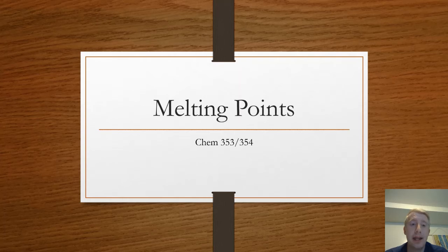All right, everybody. Today I'm going to be teaching you guys a little bit about melting point determination in an organic chemistry lab.